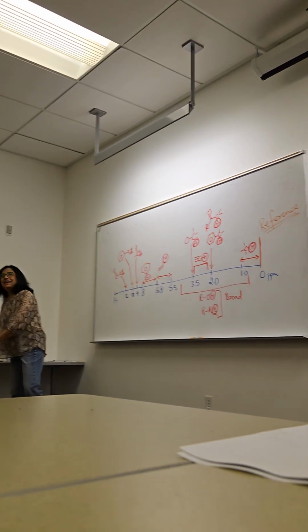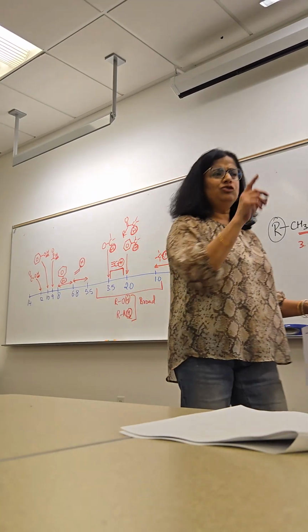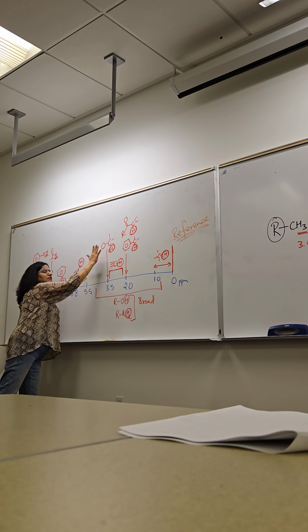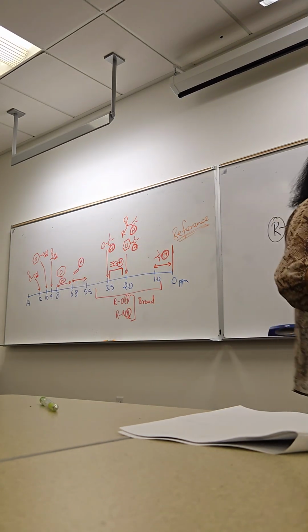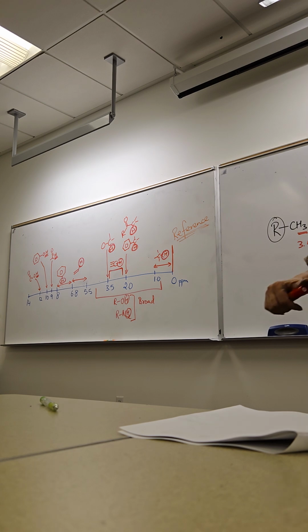So once again, I would urge you to use the table now, but get to a point where you can just imagine this in your head and say, okay, yes, an ether H shows up here, benzene shows up here, carboxylic acid here, so on and so forth. So we are not tied to the table. Okay, so that is chemical shift.